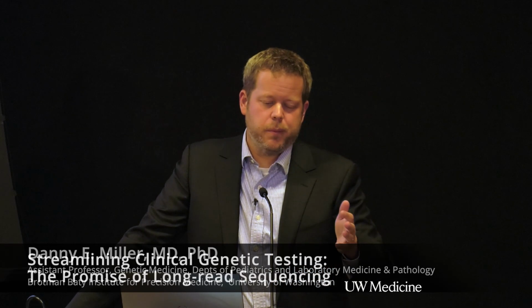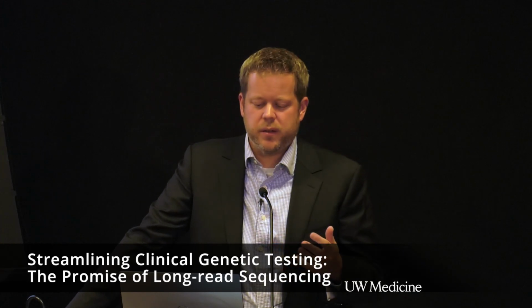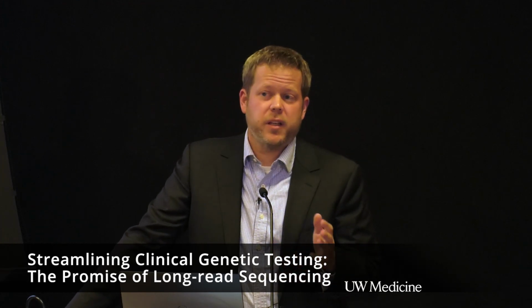Yeah, so Brian's question is a good one. How can you improve your quality based on the different technologies? And does having more quality or less quality affect your variant interpretation? So in no particular order, with something like phased assemblies, it's much easier to do things like structural variant calling, right? Especially if it's complex, with multiple rearrangements. If you can assemble that and then look at the graph and figure out what the path through is, it gives you a much clearer picture than if you're trying to call based on how the aligner aligned the reads to the genome.